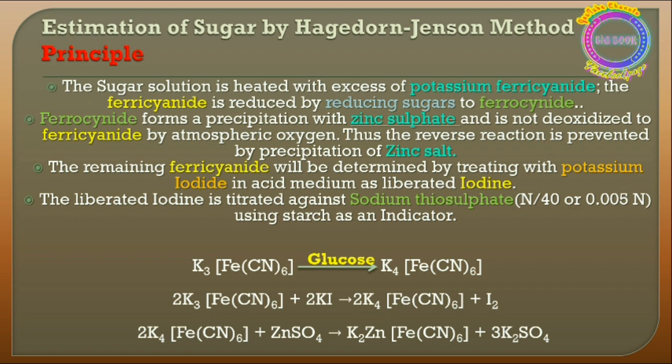Further, the iodine is treated against sodium thiosulfate. The liberated iodine is titrated against the sodium thiosulfate using starch as the indicator. Starch acts as a blue indicator.